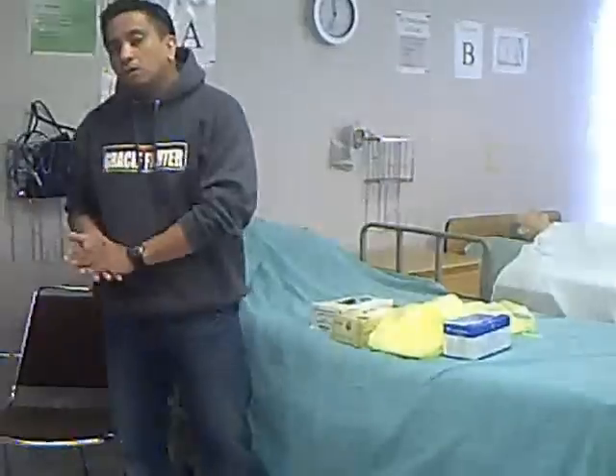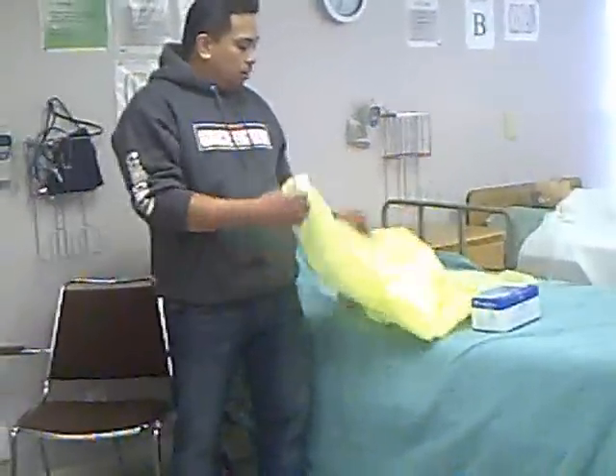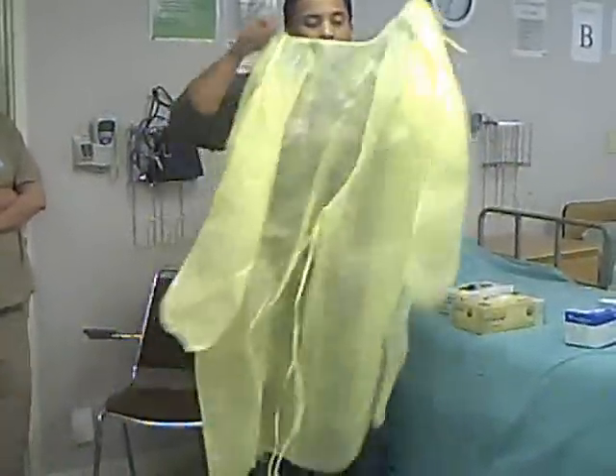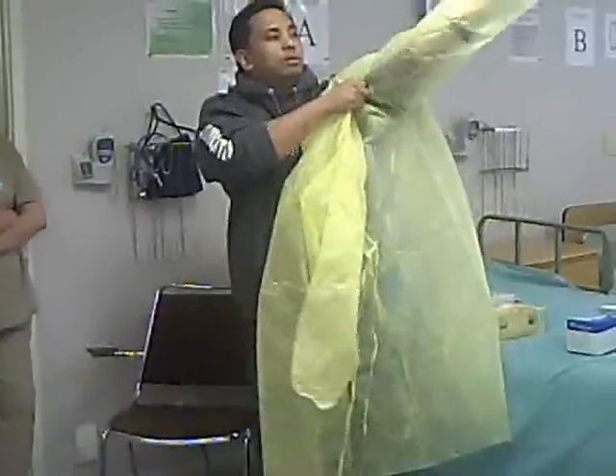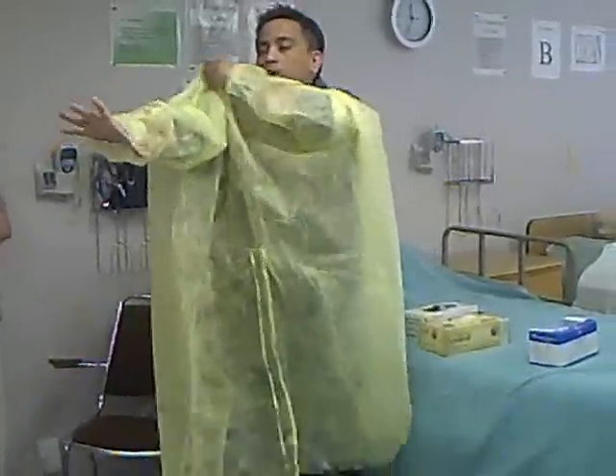So the first thing you have to do is wash your hands. After that, you put on your gown. Don't forget: it doesn't matter how you put on the equipment — what matters is how you take it off.